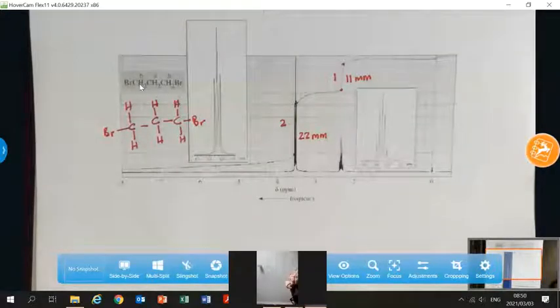That's why we represent this CH2 group as B, and we also represent this CH2 group as B. So we're using these lowercase letters to show you which of the groups are equivalent and which are not. So this hydrogen is very different from this hydrogen because that's an A and that's a B. And you saw that because this carbon was next to two hydrogens that were next to a CH2Br and a CH2Br.